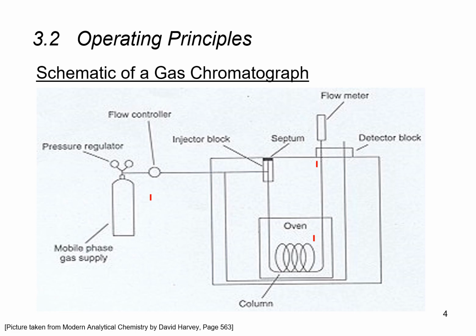So right here at the end of the instrument, we see the detector. So the detector's main role clearly is to detect the various chemical components that are passing through the column, and therefore after being separated, we need to see that there are various chemical components that are present in this sample. So these are the three general parts of a gas chromatography instrument, and again we'll describe each of these in a bit more detail as we progress along.